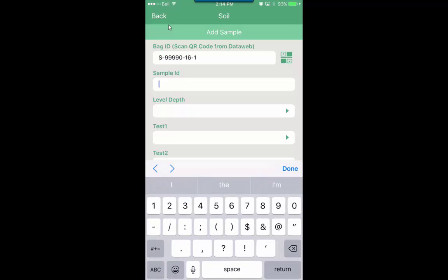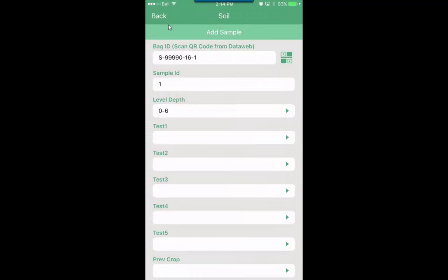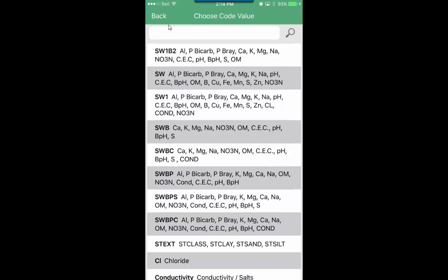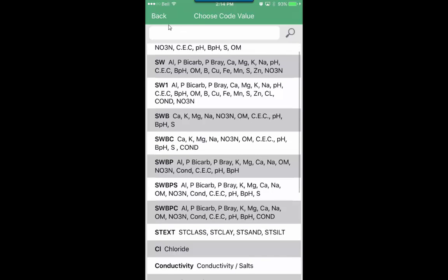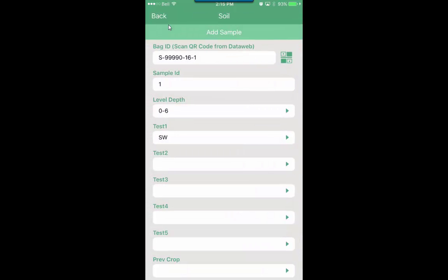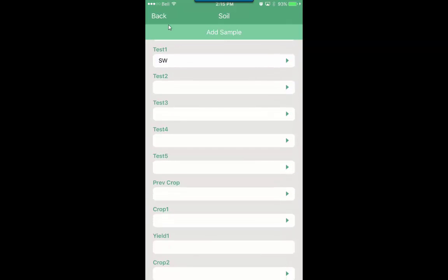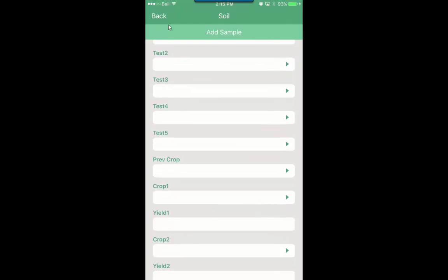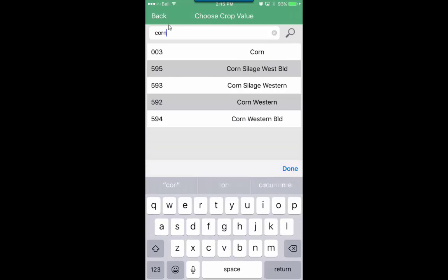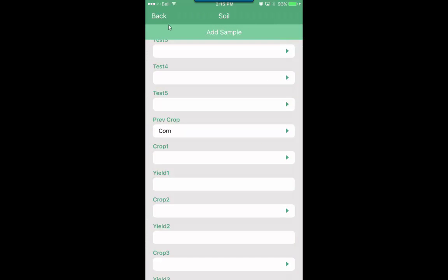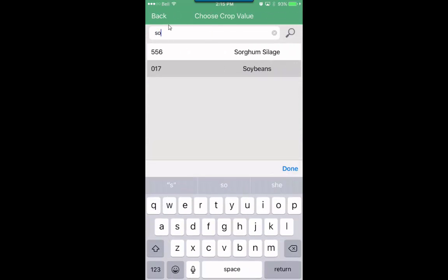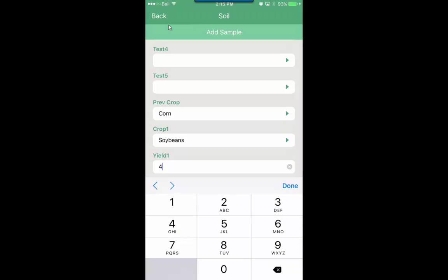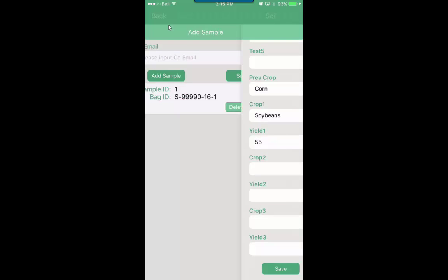We can give it a sample ID, give it a depth. We can select a test and based on your account settings you'll have your own set of tests here, Western or Eastern specific, that sort of thing. So we can select up to five different tests as well as crop recommendations. If you just start typing the crop name it'll fill in the crop for you and a default yield. You can always override that yield if you'd like there. And then at the bottom you just hit save.